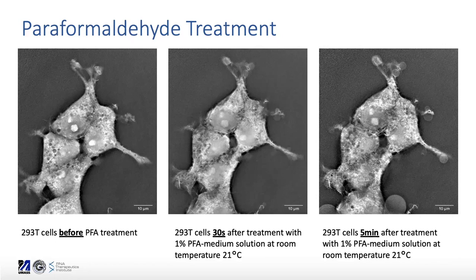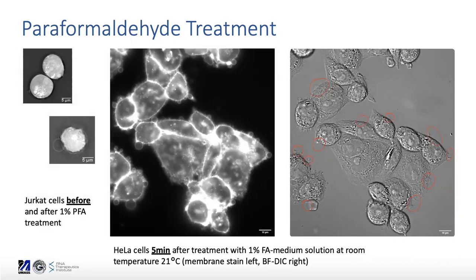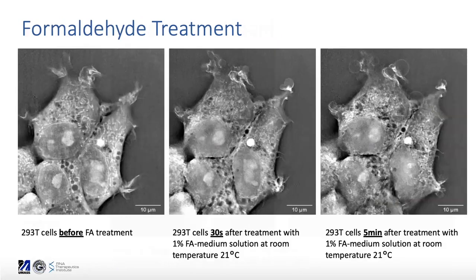This effect is not very cell-type dependent. I've done this with Jurkat cells as well as HeLa cells — the cell line used at the beginning — and 293T cells shown on the first slide. The difference between paraformaldehyde and formaldehyde isn't large. In images of fixed 293T cells treated with formaldehyde instead of paraformaldehyde, those blebs show up as well, though not as large, and you can also see the interior of the cells changing quite a bit.